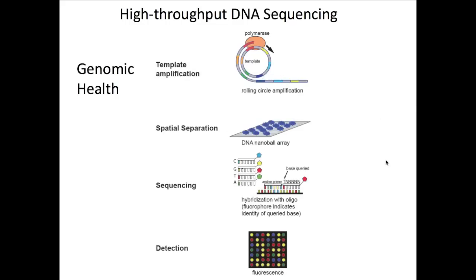A final strategy that I'll mention, and this is using one example, is a company, Genomic Health. They have their own method for doing the sequencing, and they've chosen not to sell instruments to other people, but to have a centralized facility where they do the sequencing. But it uses a different principle, one that's somewhat similar to one in another instrument category, which is the SOLiD instrument.